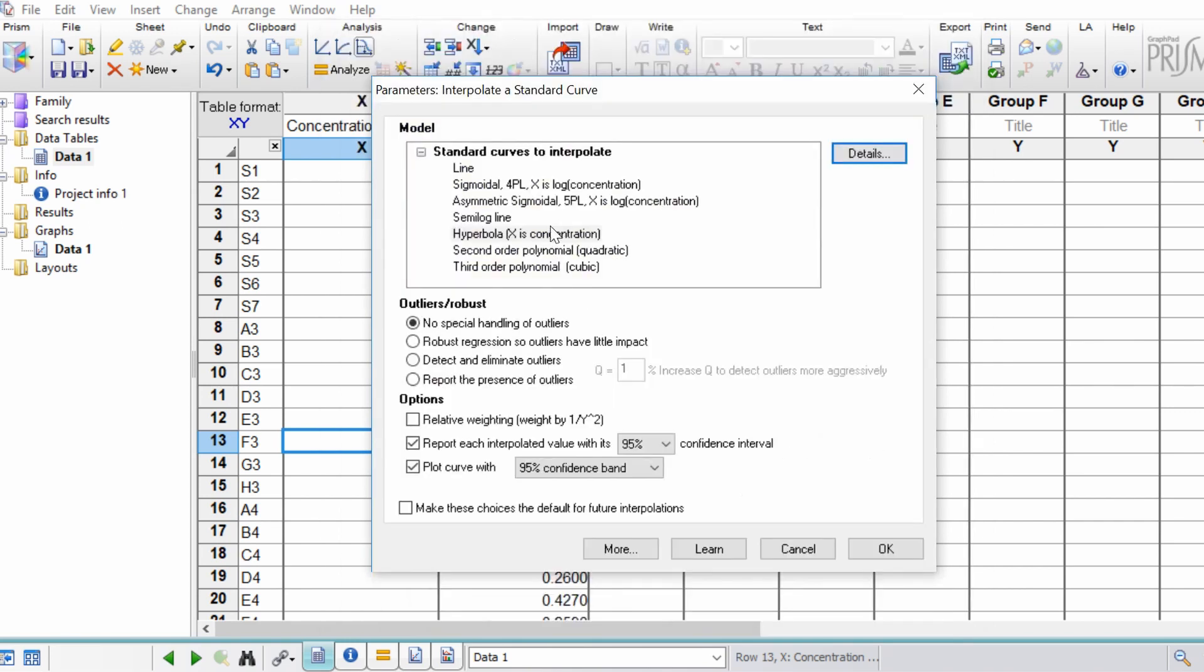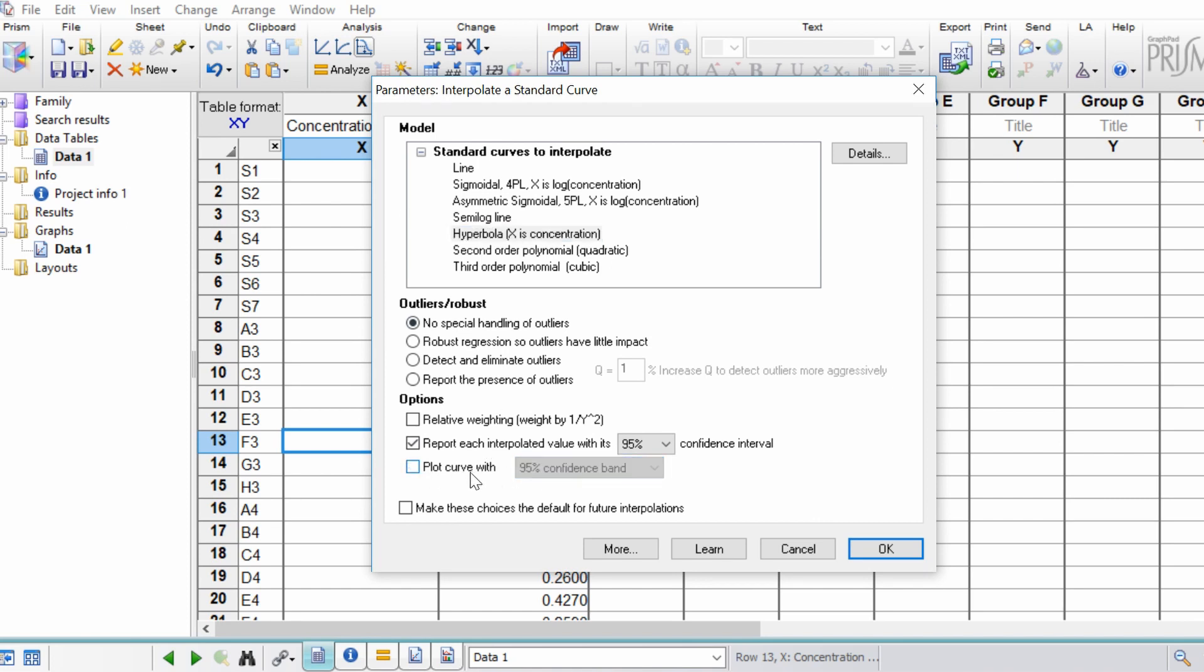So I'm going to click hyperbola and then what I'm going to do is untick the plot curve with 95% confidence band. Basically GraphPad will give you a graph for your standard curve, and if you leave this ticked, it will then give you the 95% confidence intervals. But I don't want to report this.